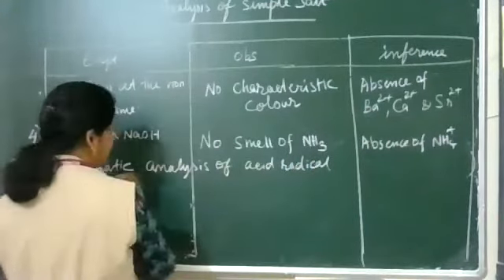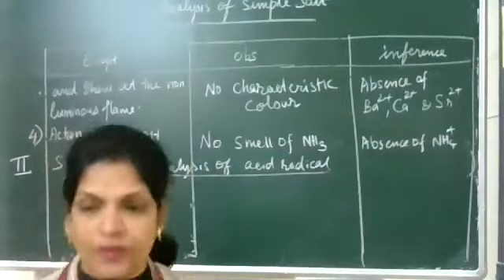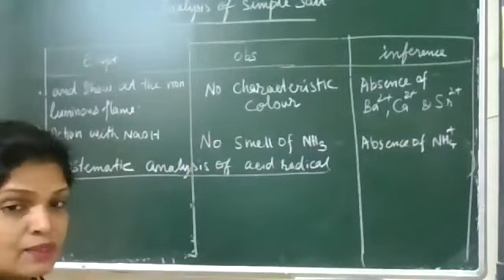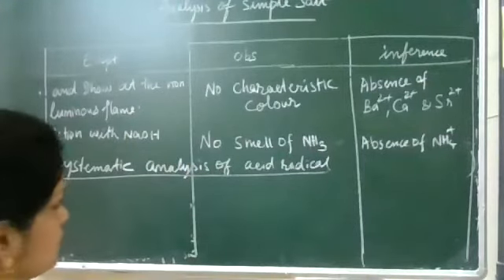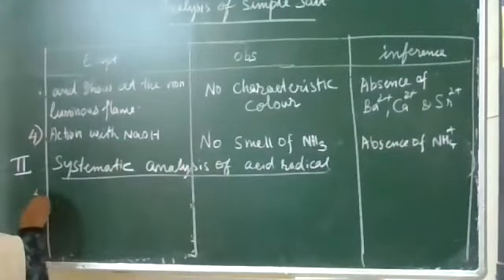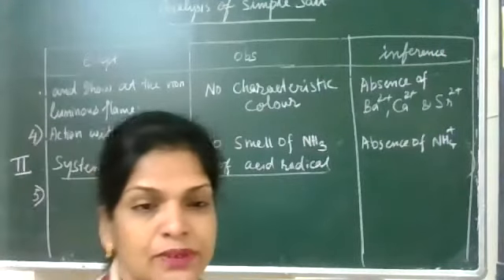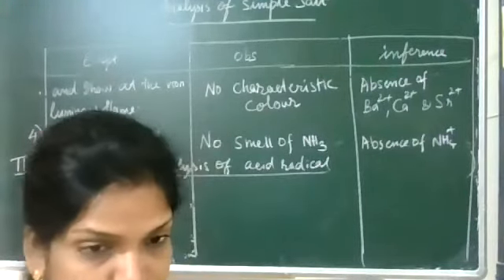So this is the heading. Heading you can write from left to right till it goes. Now number 5, or you can write number 1. Number 5. First we are doing with the dilute H2SO4 test.